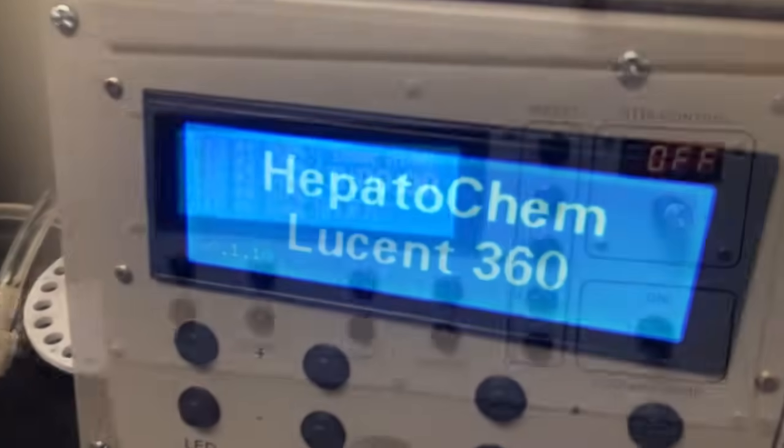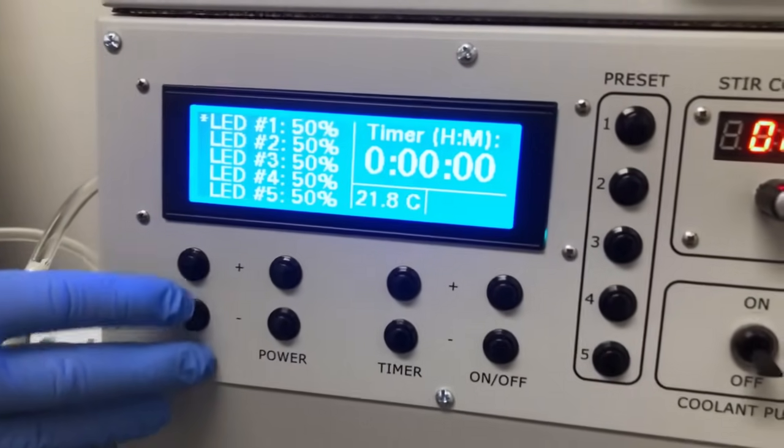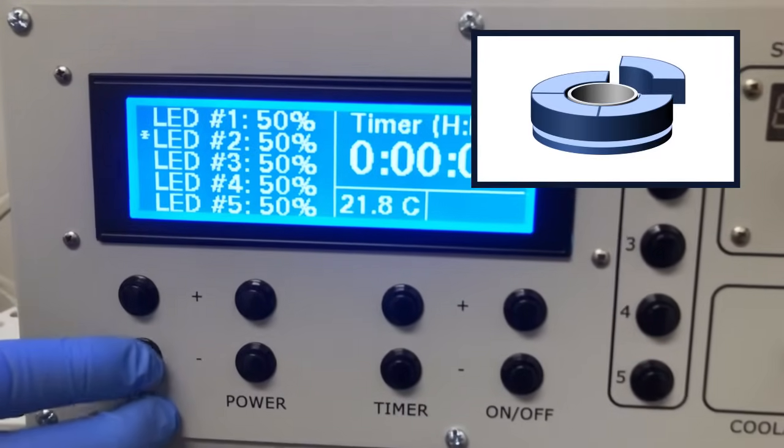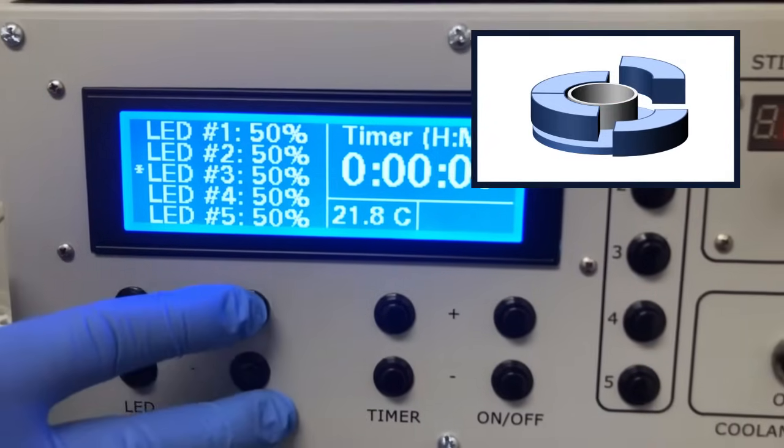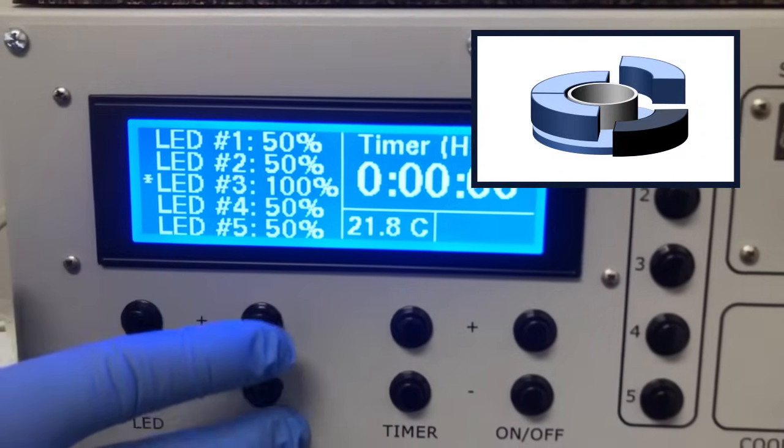The LED buttons allow you to control the intensity of each module. As we navigate from the first module to the second and then to the third module, you can also see how the power buttons enable us to adjust the intensity of a specific module.